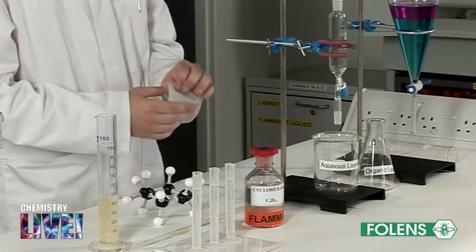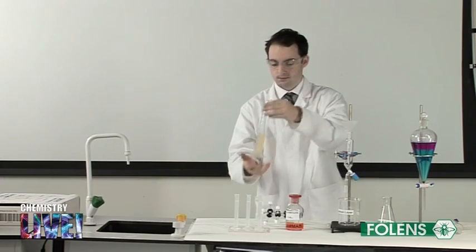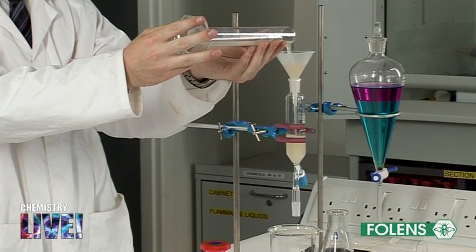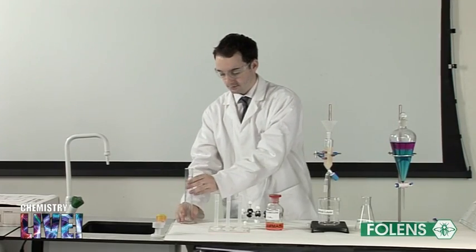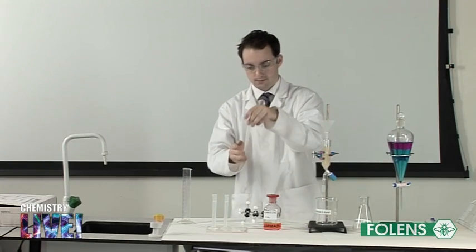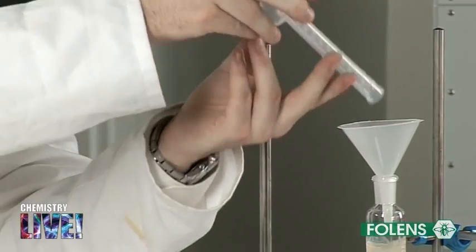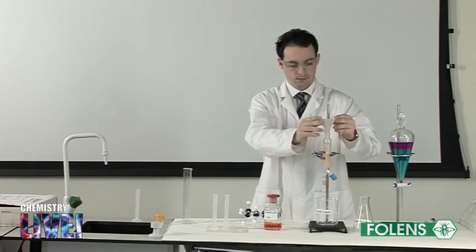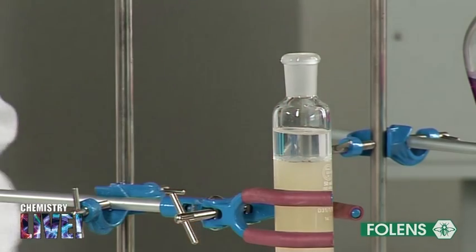Using a small plastic funnel, place 50 cm³ of the clove oil emulsion in the separating funnel. Add 10 cm³ of cyclohexane to the separating funnel as shown. Note that the cyclohexane, the organic layer, floats on the emulsion, the aqueous layer, since cyclohexane is less dense than water.